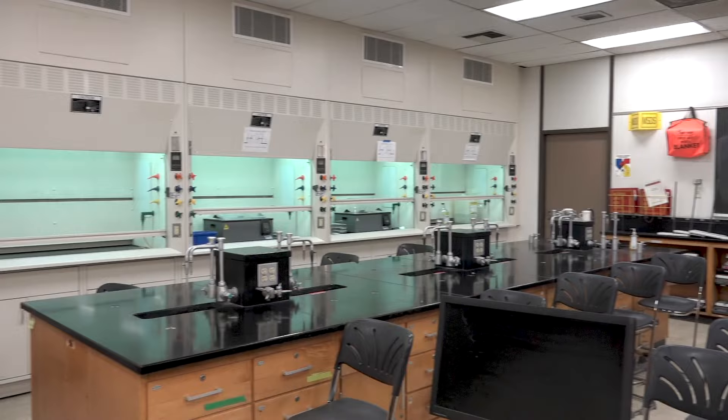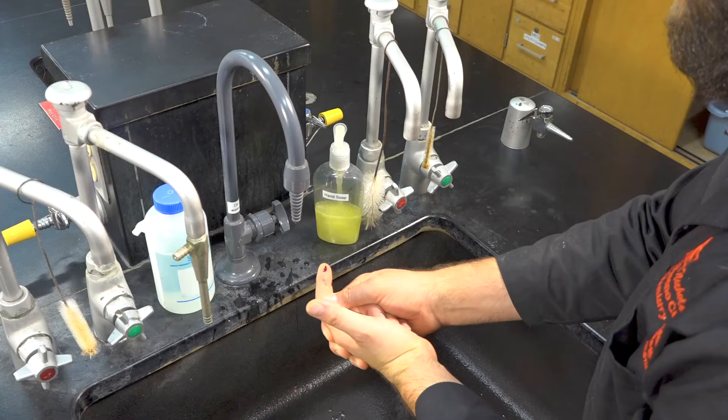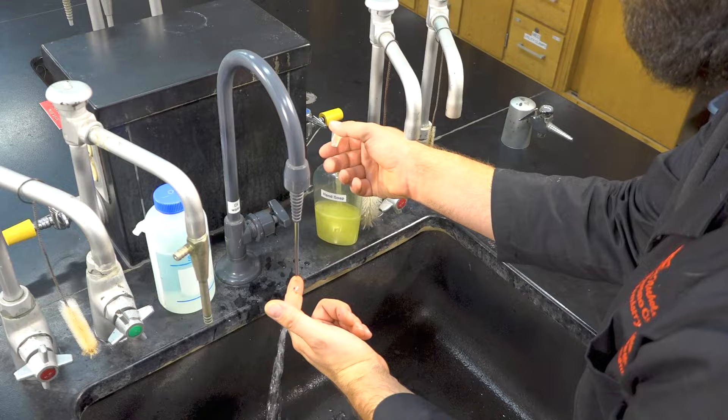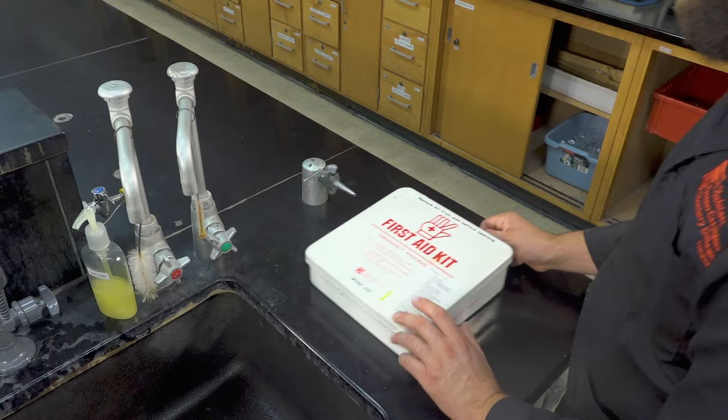Chemical reactions that utilize or produce volatile chemicals should be carried out in the fume hood. Minor injuries, such as cuts and scrapes, can be treated using the lab's first aid kit. This has all the basic materials needed to clean and dress minor wounds. Cleaning wounds is especially important because of the potential for chemical contamination.